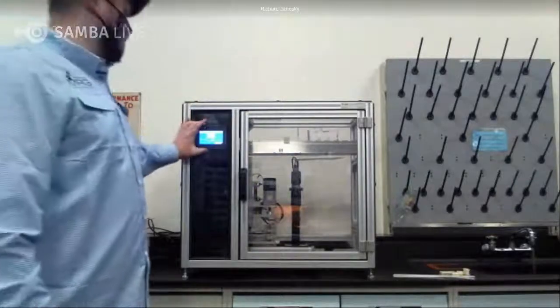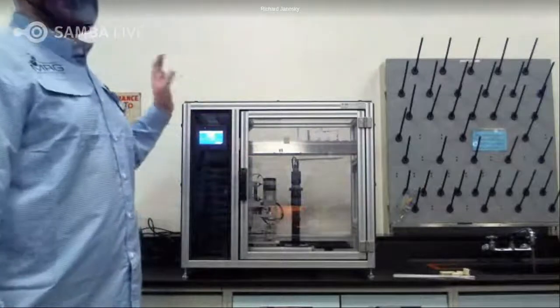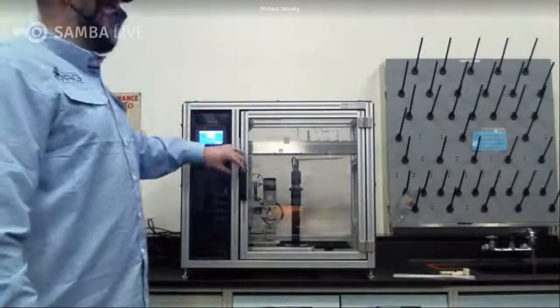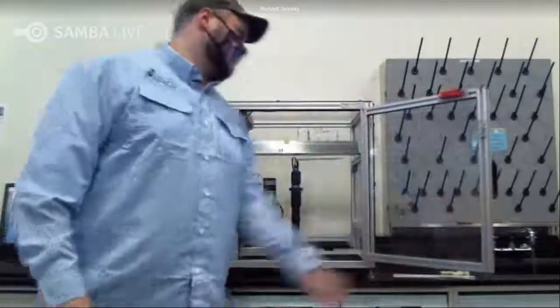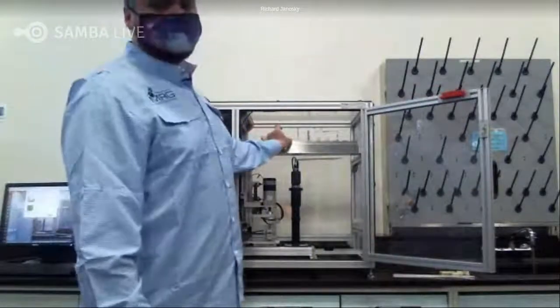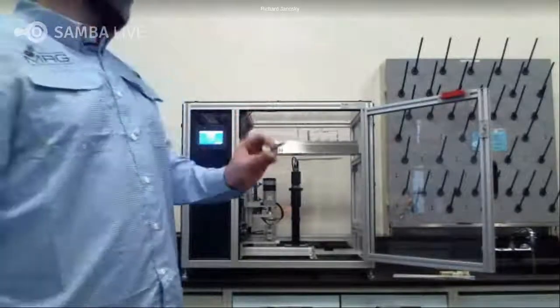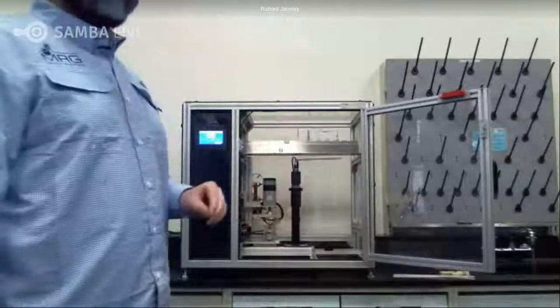On the front, you have a small HMI screen that allows you to control it. It's going to run your calibration and run samples. It allows you to turn the heating rack on and off. So on top, heating rack samples are put up there. That maintains their temperature so that each sample is running the same test. So here's one prepared already. I will show you how to prepare a sample as well when we get to it in time.